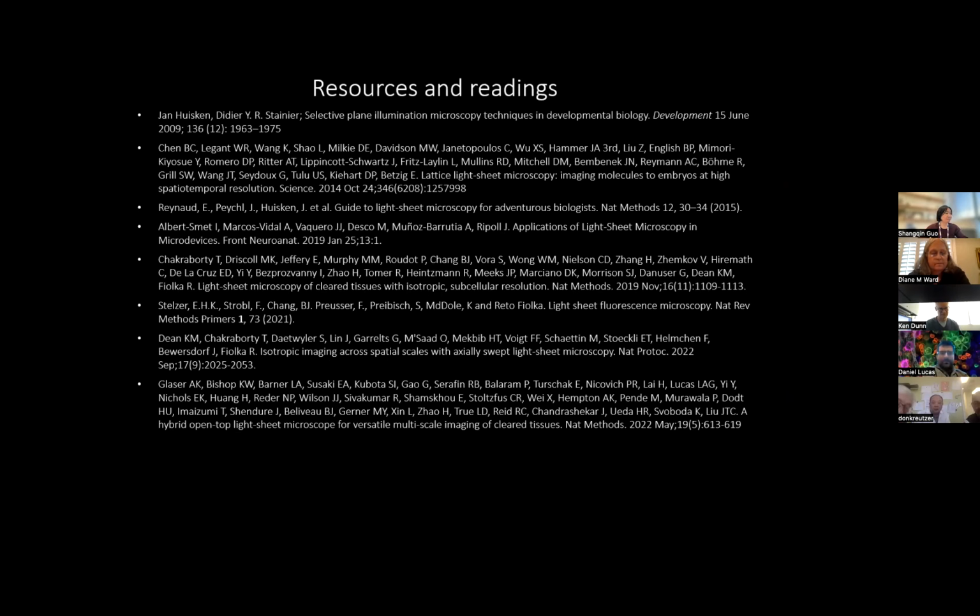I have a question. Most of what I've seen about light sheet microscopy is outside the bone marrow. Right, and this is because of the limitations of the tissue. Have you seen any recent papers where you don't have to permeabilize and stain for days to visualize the marrow? Well, I am not in a position to talk about this, but all the volumes I showed you showed the bone marrow. I don't know how the tissue is prepared to access the bone marrow. I don't know if you're imaging through the bone.